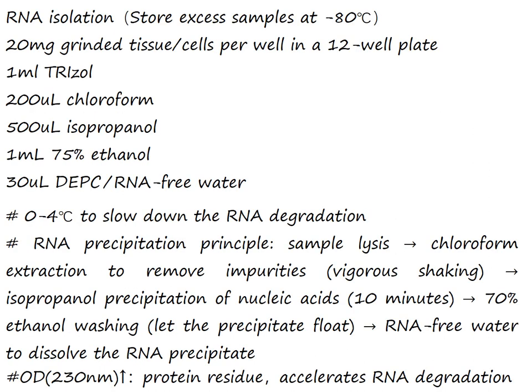Here are the reagents we need for RNA isolation. The sample goes through lysis, chloroform extraction, isopropanol precipitation, ethanol washing, and then we dissolve them with RNase-free water. Always keep your samples cool. It helps to slow down the RNA degradation.